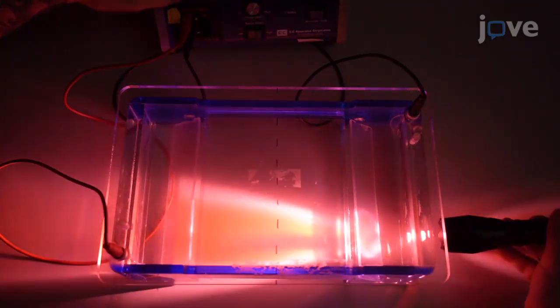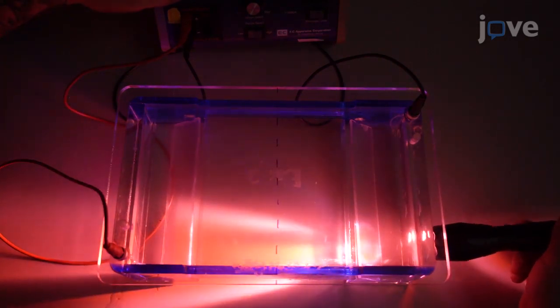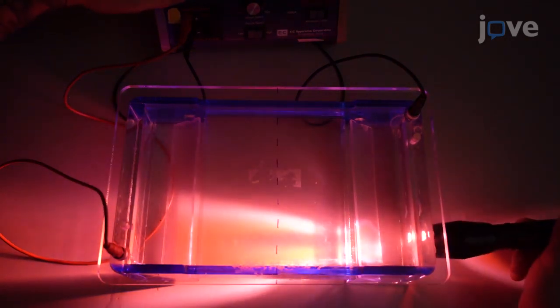The Shuttlebox assay allows for relatively simple, rapid, and robust measurement of associative learning and both short and long-term memory in zebrafish.